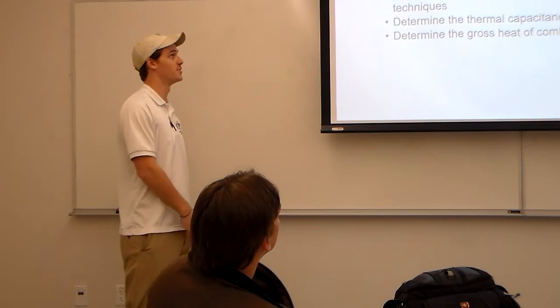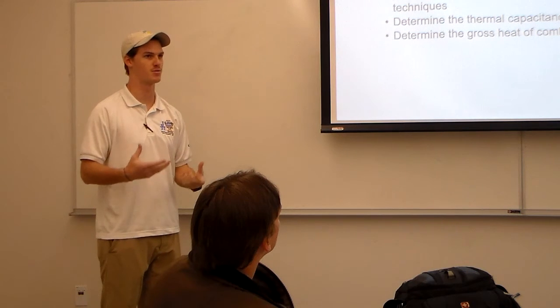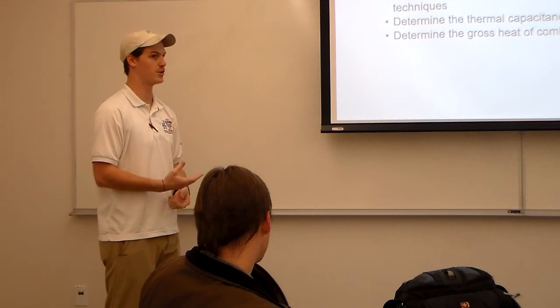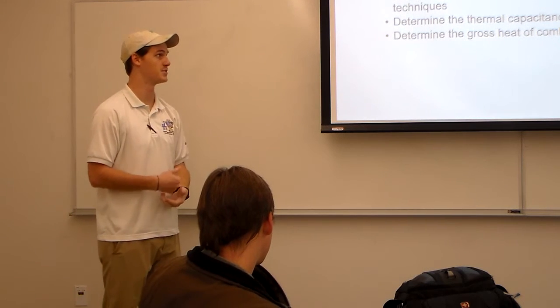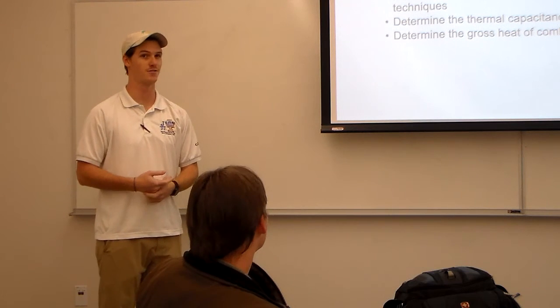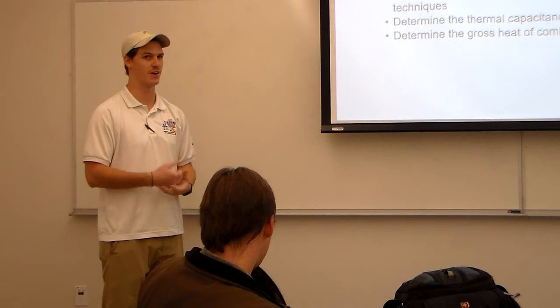So our introduction: our bomb calorimeter is designed to measure the heat liberated by a combustion process. Our objectives for the lab are to familiarize ourselves with the physical properties, the method, and the analysis techniques, determine the thermal capacitance of the calorimeter itself, and then determine the gross heat of combustion of the provided samples.